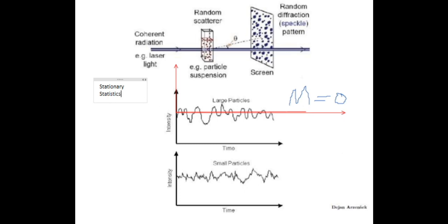This is an important assumption, and the reason is that the system is at equilibrium. So always keep it in your mind. And another assumption that we made is that the mean value is 0. So now let's proceed to the statistical and mathematical analysis of this pattern.